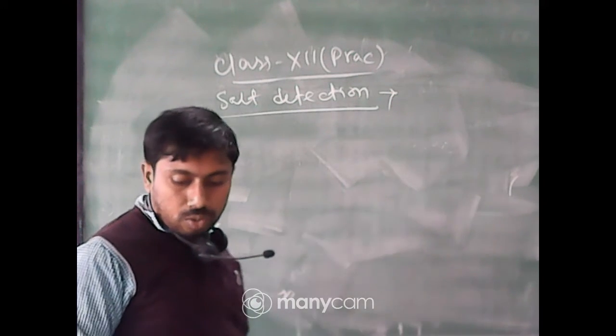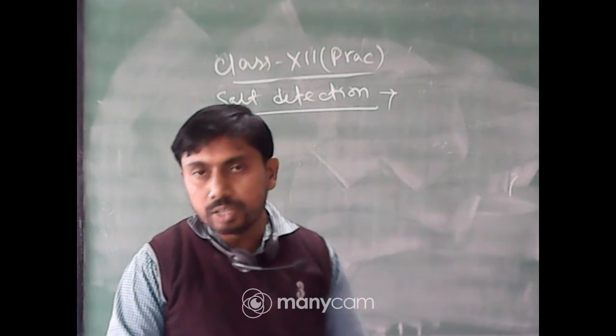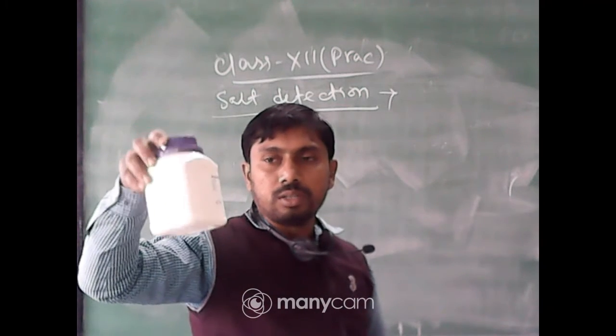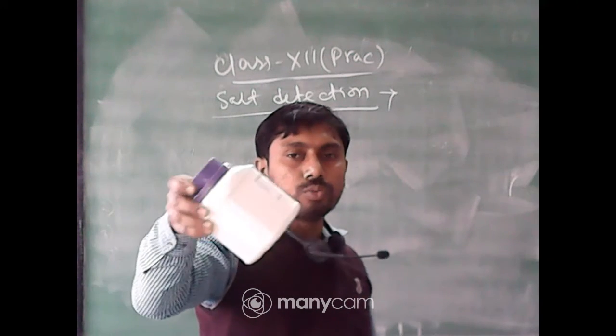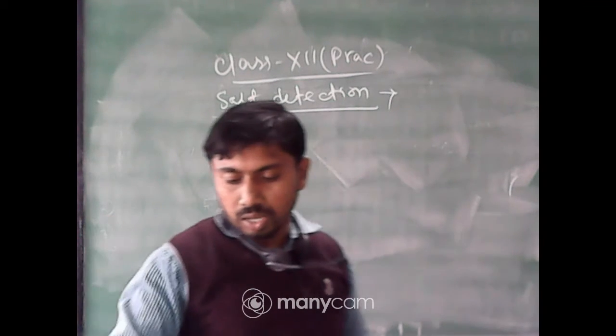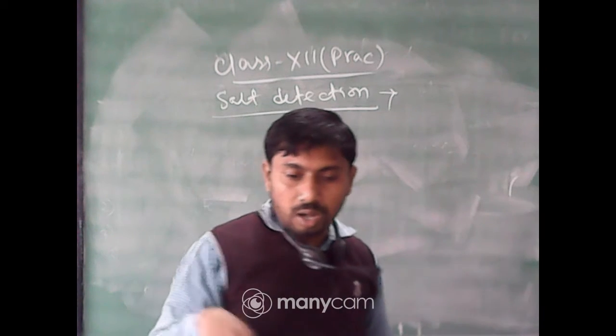For this, one inorganic salt will be supplied to you. Now I am taking a salt from this bottle. This is known to me. This is zinc nitrate, a group 4 salt. Now how to treat it?